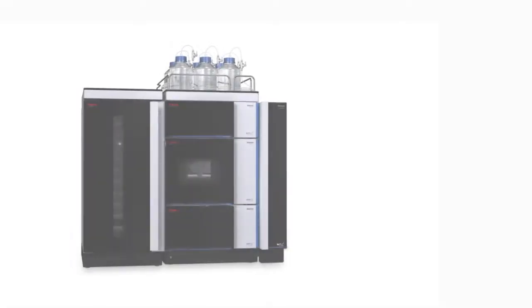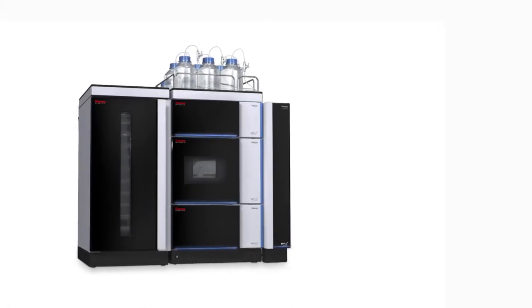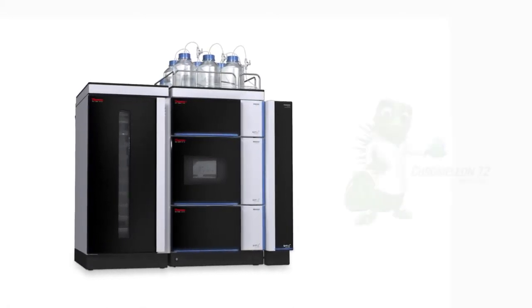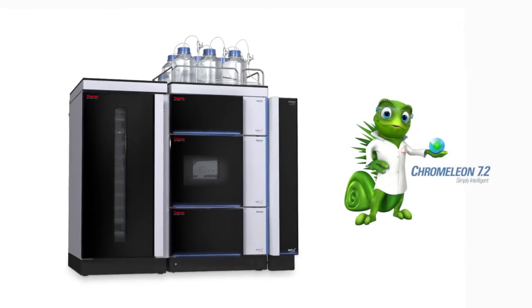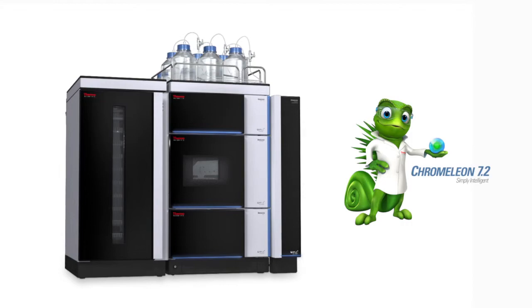You can extend your workflow capabilities with multiple switching valves and track your column records with the new Column ID system, fully integrated into our Thermo Scientific Dionex Chromeleon chromatography data system software, allowing you to experience maximum control over your separations.